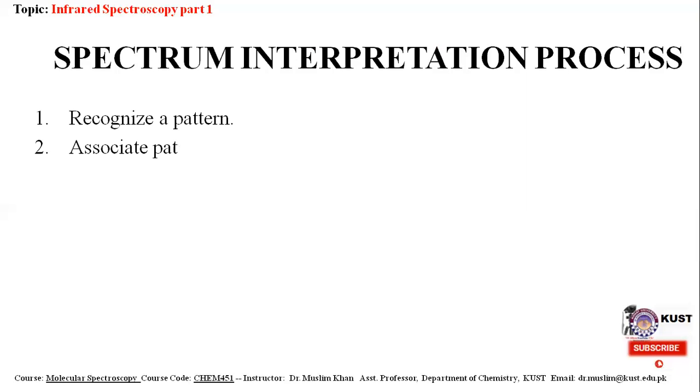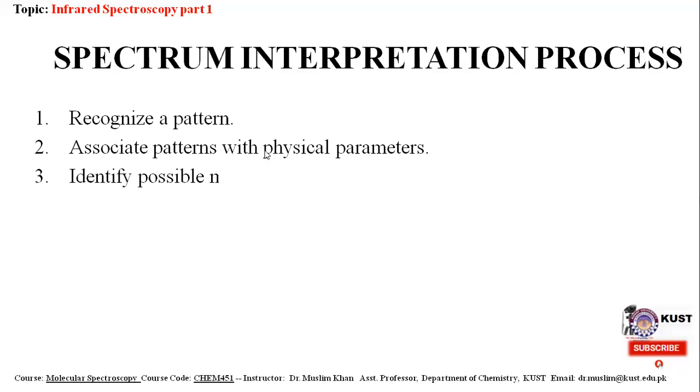Whenever we are interpreting a spectrum, we are basically recognizing a pattern, associating this pattern with some physical parameters, and then identifying possible meanings and explanations.